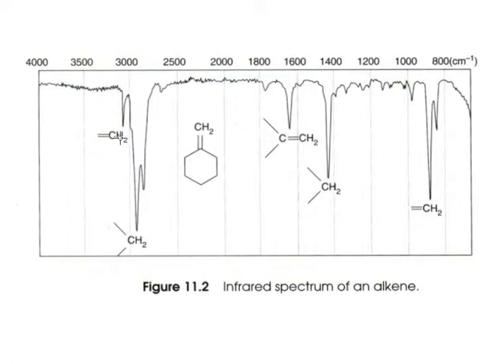Moving from left to right, we come to this small peak. As we pointed out, this peak is caused by the alkenyl CH bond undergoing a stretching motion, absorbing infrared light. It occurs at about 3050 wave numbers. Now, one thing to realize about this peak, though, is that it's sharp but relatively small compared with other peaks in the spectrum.